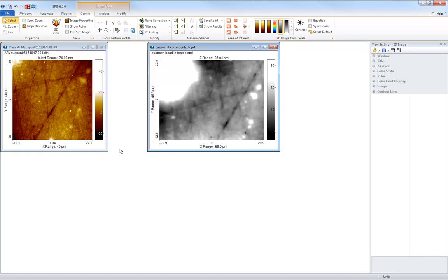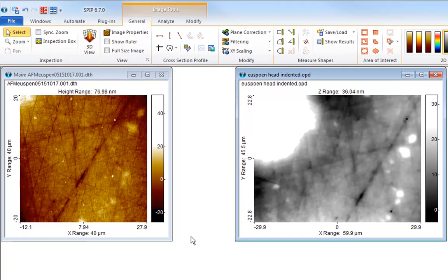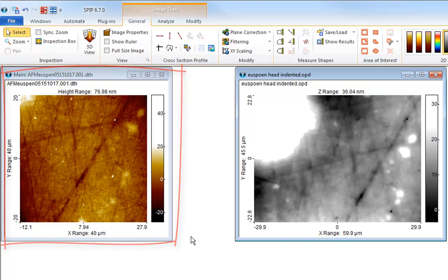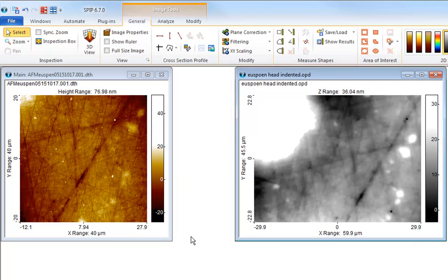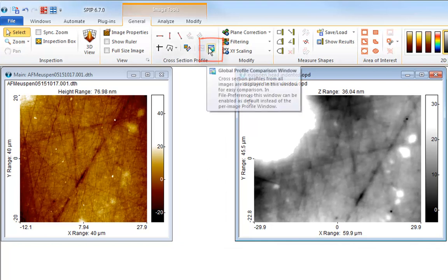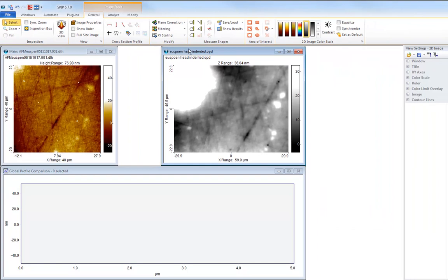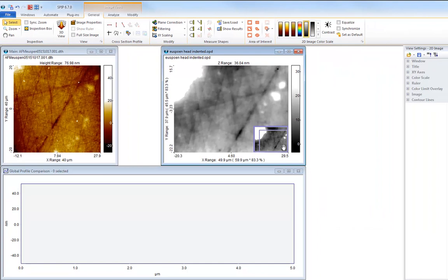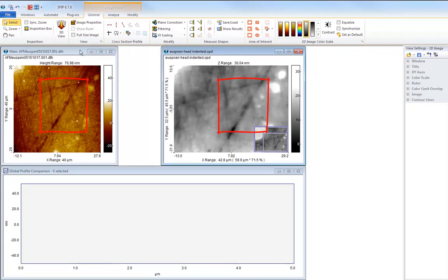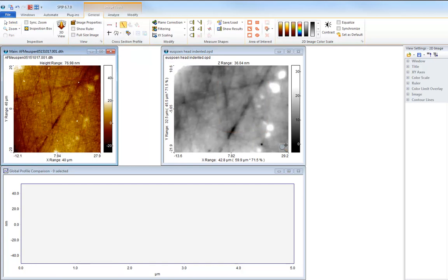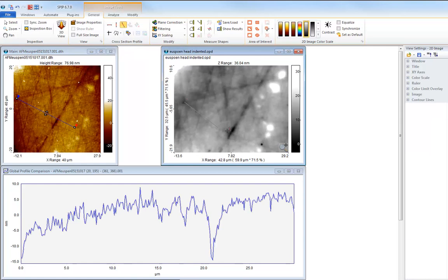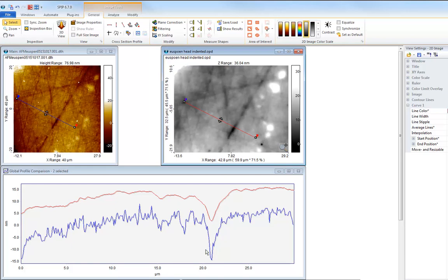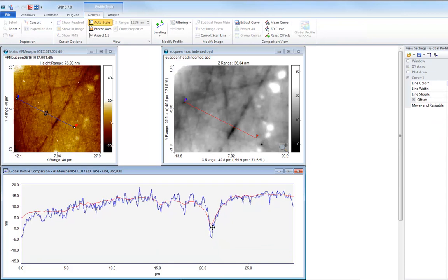Or one can, for example, be an SEM image and the other an AFM image. In this case, we have on the left side an AFM image and on the right side an image of the same surface recorded with an interference microscope or optical profiler. Let us first open the global profile comparison window. Note the scratches forming a characteristic triangular structure in both images. We will now draw a cross-section from this point to this point on both images. In the global comparison window we can now fine-adjust the position of the two profiles in order to compare them better. The higher resolution of the AFM is clearly observable.